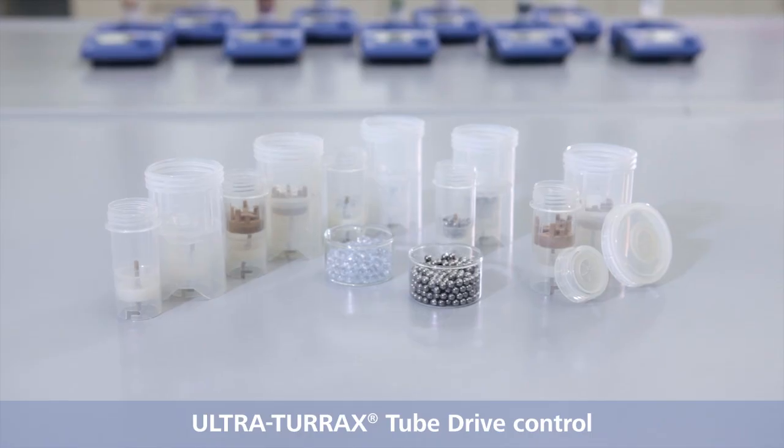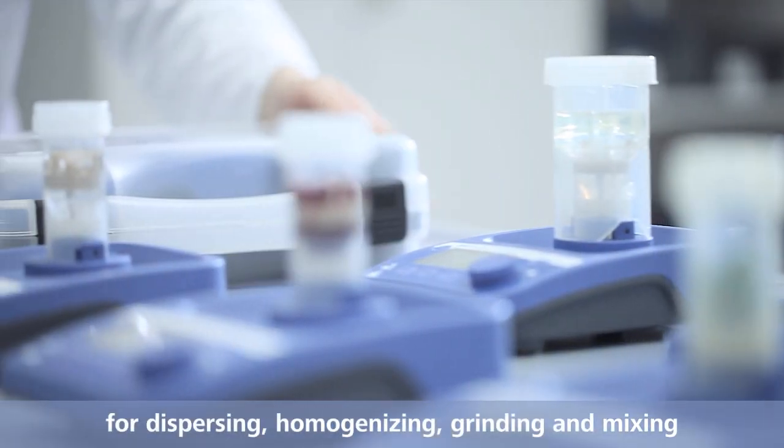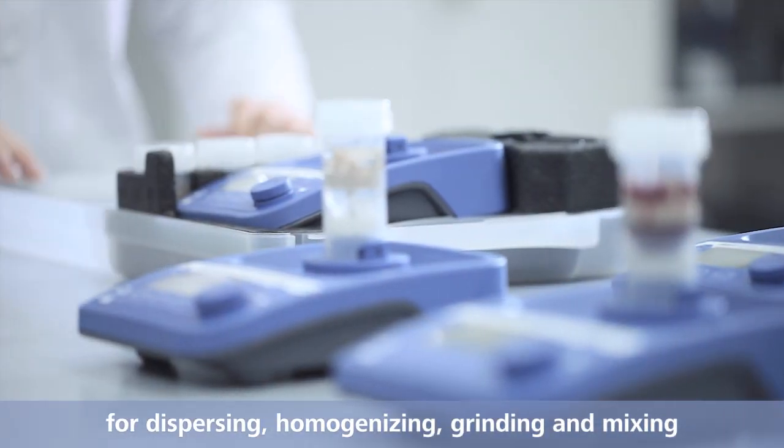Ultra-Turrax tube drive control for dispersing, homogenizing, grinding and mixing.